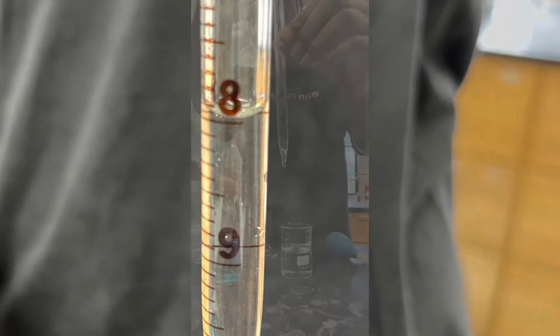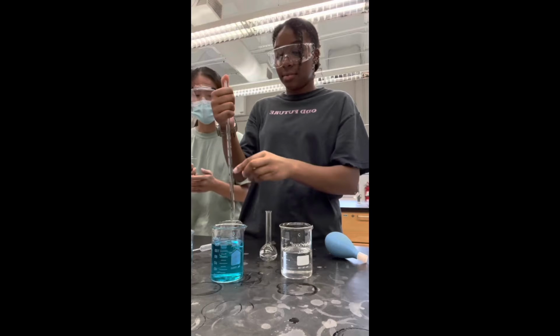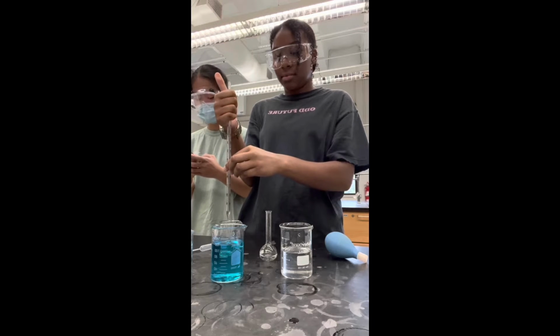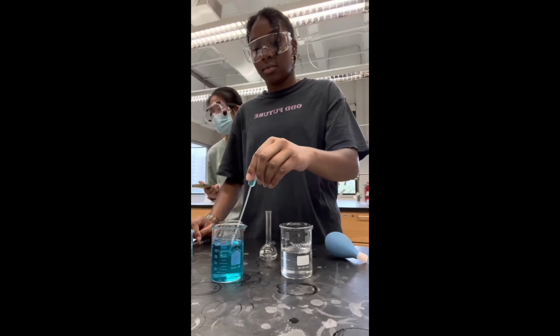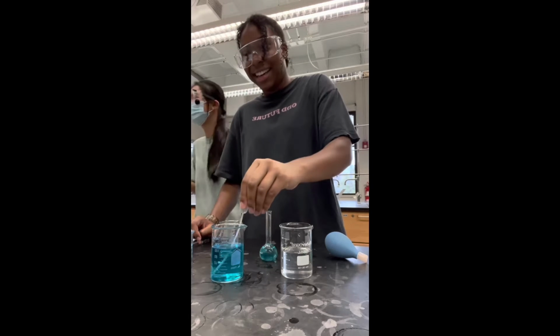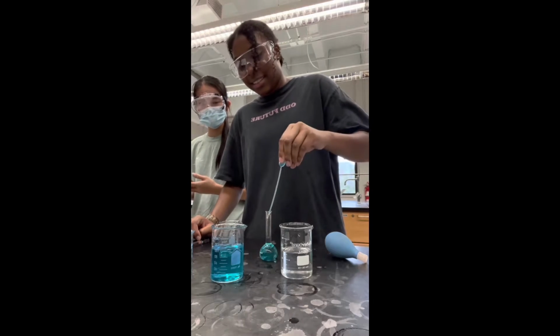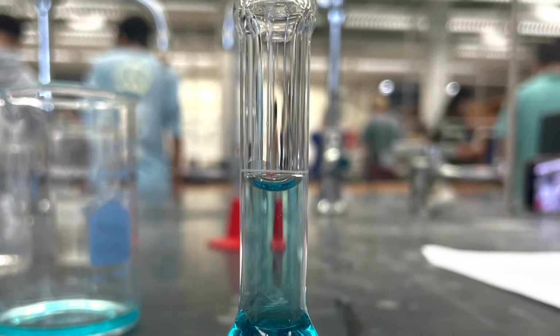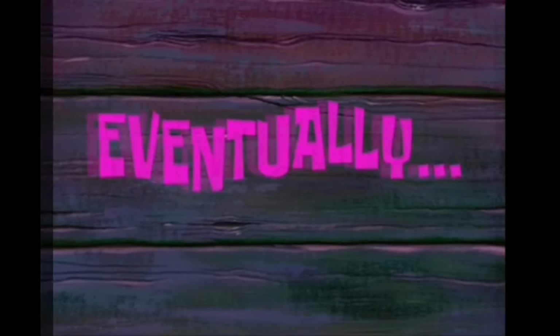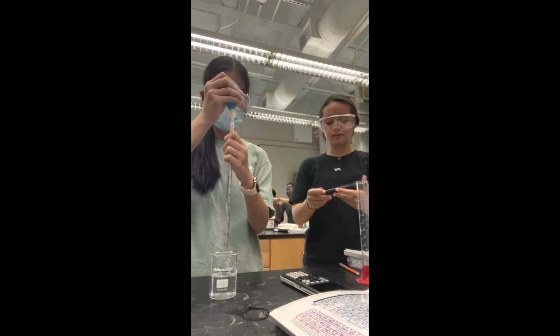Her initial amount was 9.71 and her final amount was 1.97, which gave us the volume of 7.74. We would multiply that by the 20% concentration and we would get the overall concentration would be 6.19%. So we all repeated what Madison did.